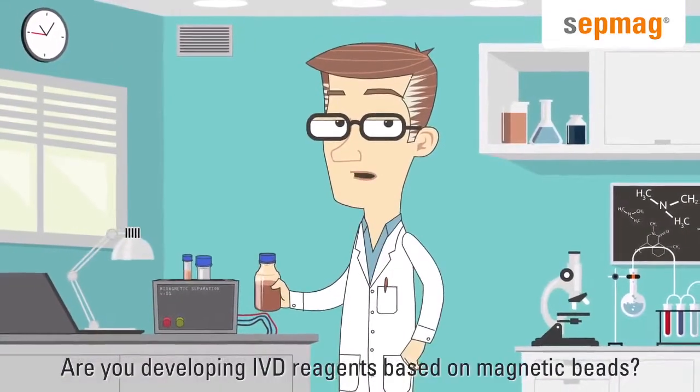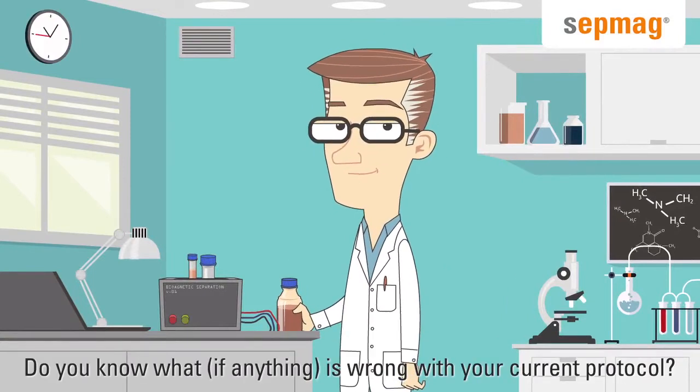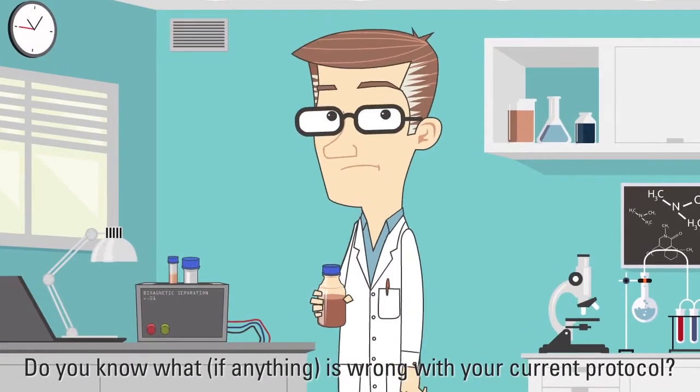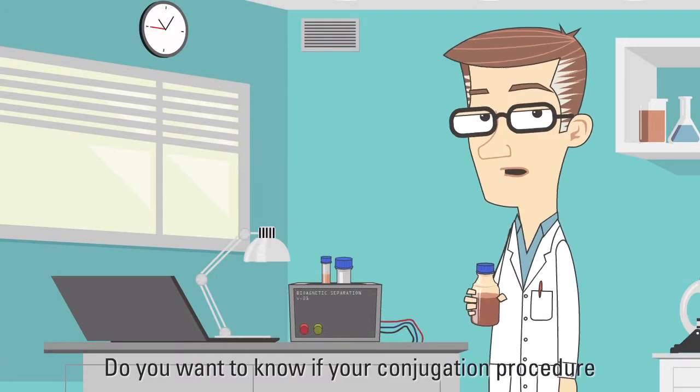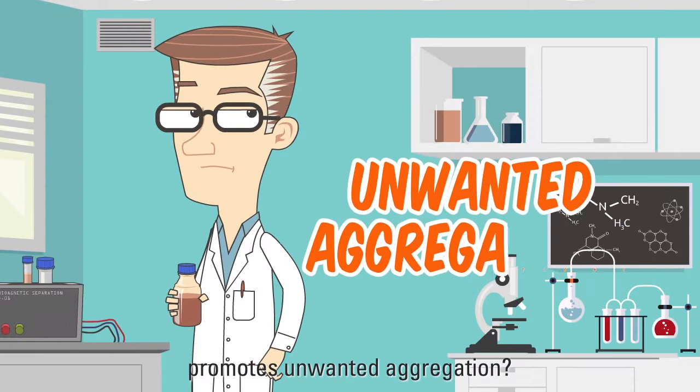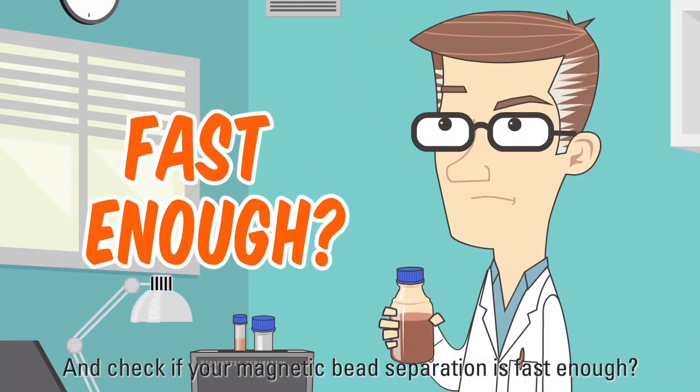Are you developing IVD reagents based on magnetic beads? Do you know if anything is wrong with your current protocol? Would you like to gain more control over the process? Do you want to know if your conjugation procedure promotes unwanted aggregation? And check if your magnetic bead separation is fast enough?